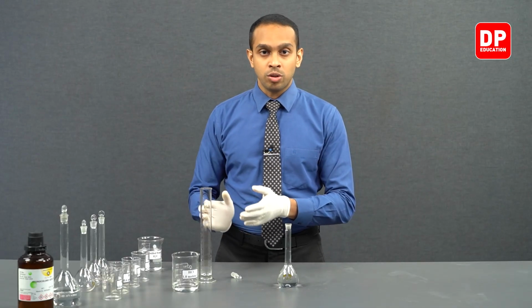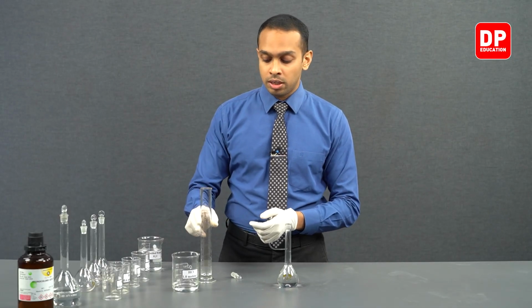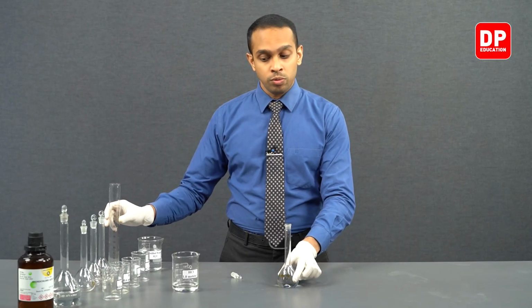Now students, we have transferred all of the HCl that was present in our measuring cylinder into the volumetric flask.